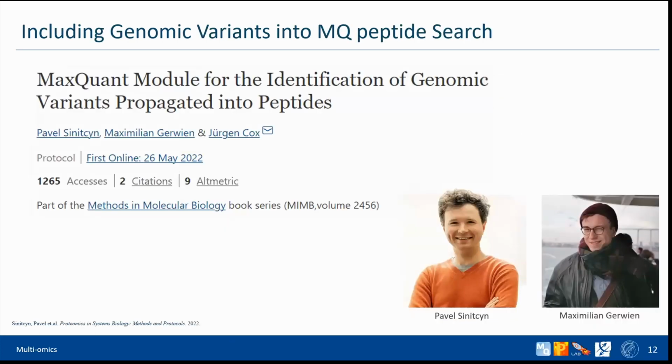So if you are an expert in NGS, congratulations, it's not a problem for you at all. You can assemble your own customized protein database for the database search by yourself. But for researchers that have less experience in NGS, Pavel and Max built a module. Pavel was a PhD student and postdoc from our group, and Max was a master's student.